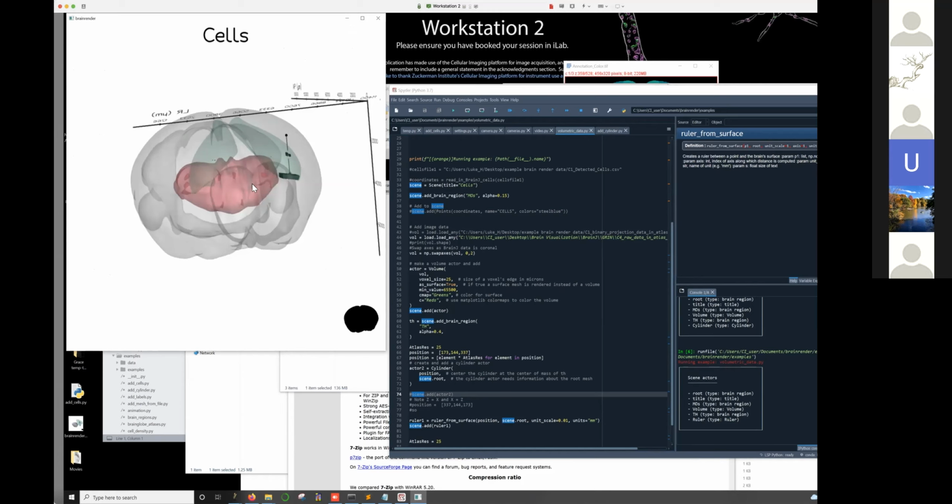I have a question. This was very helpful. I know you used the example of the ClearMap for this, but is this generalizable to BrainJ data? Oh yeah, absolutely. The data that we're looking at right now is from BrainJ. And I have the cell import for BrainJ working as well. So I'll share scripts for the cell import for BrainJ with the filtering for the different brain regions.